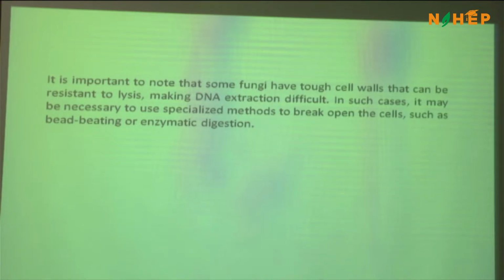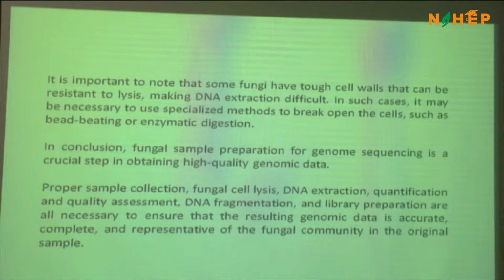You have to go for physical and chemical force, right? Sometimes we use finely powdered glass as an abrasive material to really crush the fungal cell wall so that the inner contents come out. That is recommended also, and you can even use liquid nitrogen if you can do that. So the main point here is that bringing out the fungal DNA from the inner region is always a big challenge, right? But of course, we have excellent fungal DNA isolation kits available, and you can develop one in your lab as well.